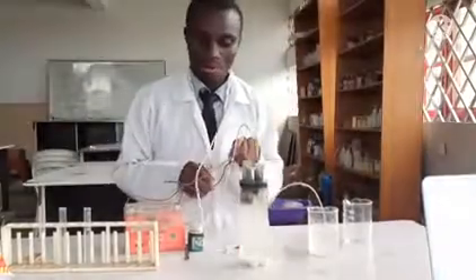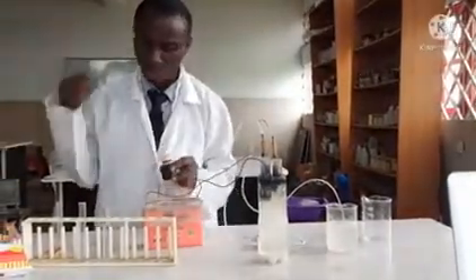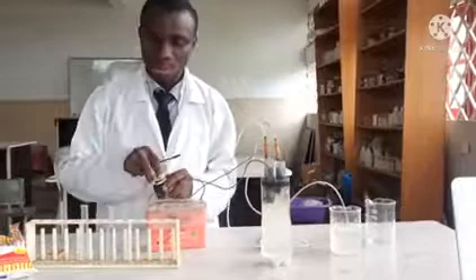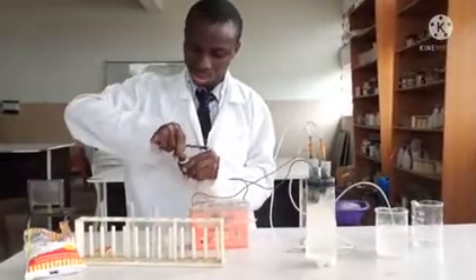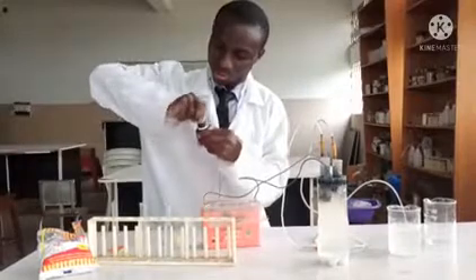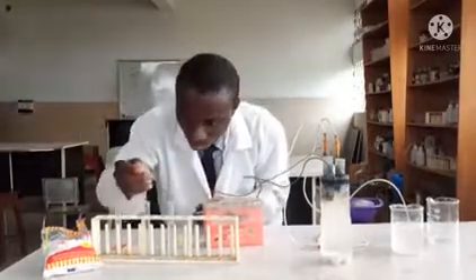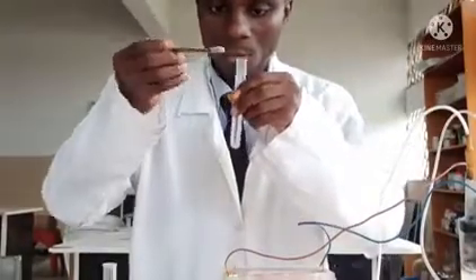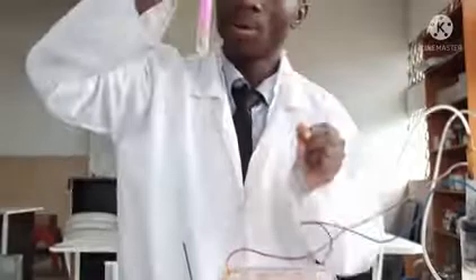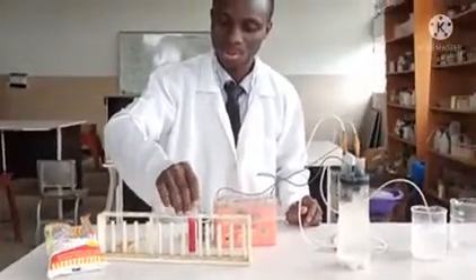This part is chlorine. And first of all, in this part of the video, we'll be producing bleach. To confirm that this solution is basic, I'm going to introduce phenolphthalein — just a little amount. The pink color shows it is basic. That is sodium hydroxide — the solution is actually there.